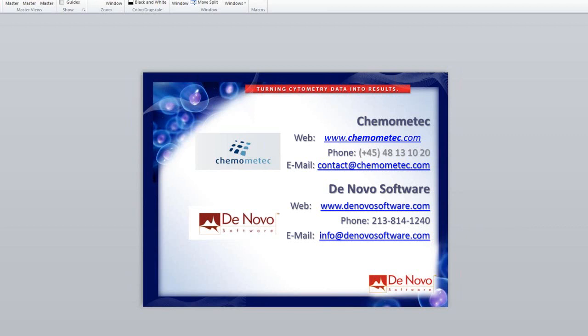This is really a great supplement to the NucleoView software that controls the NC-3000. So I really think that the De Novo software and the ChemoMetec software can work very nicely together on this, and we have very good cooperation. So I think this is covering very much everything.